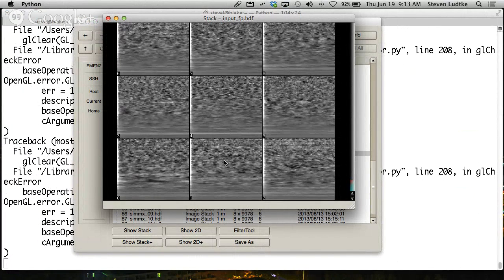They are images invariant under both rotation and translation that are representative of what's in each of the images. In other words, if we took the image of the first particle and rotated or translated it in the box, this resulting footprint image should be the same. It shouldn't change based on where the particle is located. And this gives us an easy way of classifying the particles before we have any references that we can use for translational and rotational alignment.